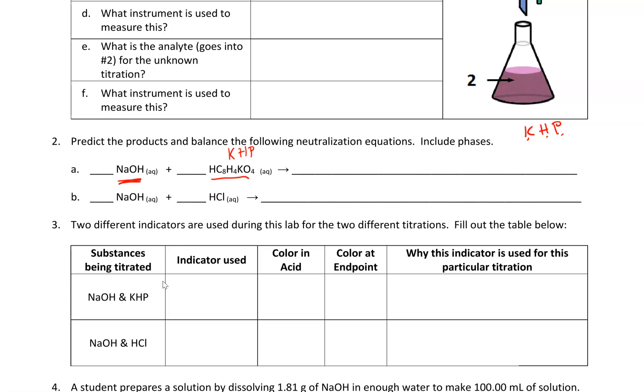So again, I can't use the mass of NaOH and the volume of the solution I made to calculate molarity. I have to do it using titrations.